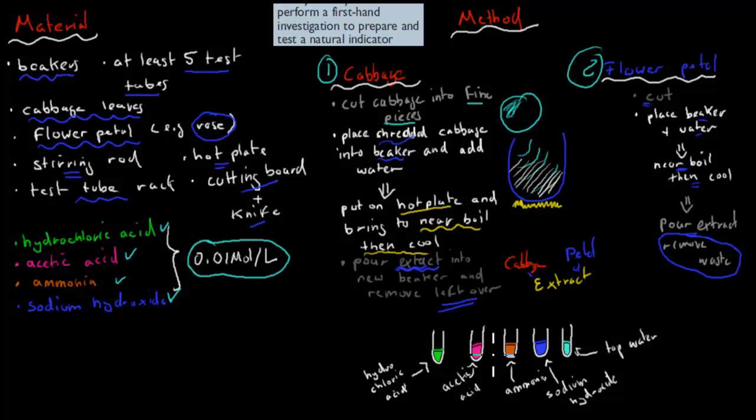We set up our test tubes. We've got five test tubes. One test tube will get our hydrochloric acid, our strong acid. Acetic acid will be in another test tube. Ammonia, our weaker base, will be put in the third test tube. Sodium hydroxide, stronger base, in the fourth. And our tap water, meant to be our neutral solution with pH of about 7, will be put in that fifth test tube.